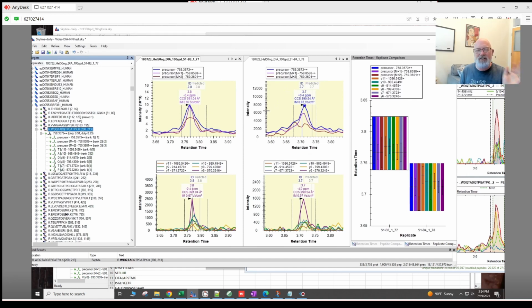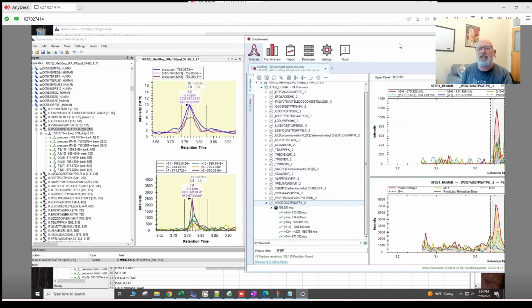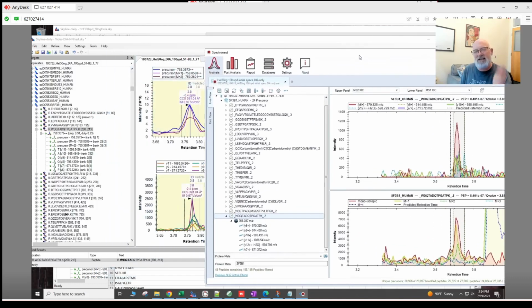Hopefully, with all this information, you can do it too. You just have to rewind, and it takes me a couple of times, as you could see in the video, to get it correctly, but it did work. All right, so we searched with DIA-NN, put the DIA-NN output in Skyline, and we can visualize the peaks, and they look pretty similar to Spectronaut. They picked the right one, at least in this example. You can go through this all day if you want to.